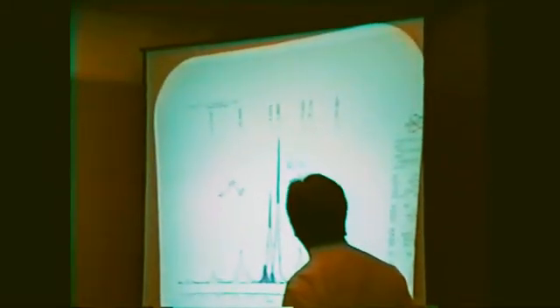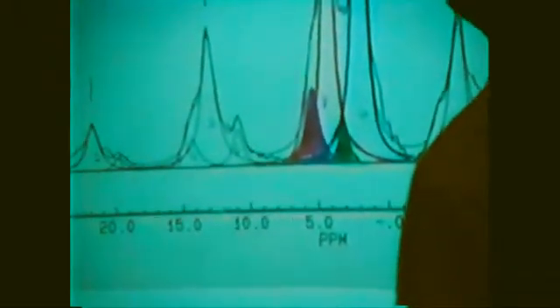As an example, this is the dealuminated zeolite, and we see that you have 1, 2, 3, and maybe a fourth peak here. These are the acidic groups. This is the silanol group. And after decomposition, we see that we have a small peak here corresponding to the aluminum OH concentration. And we must know absolutely the concentration of the acidic OH.